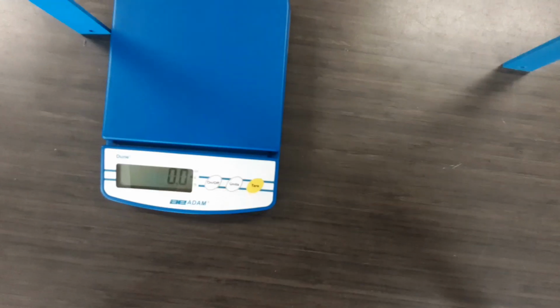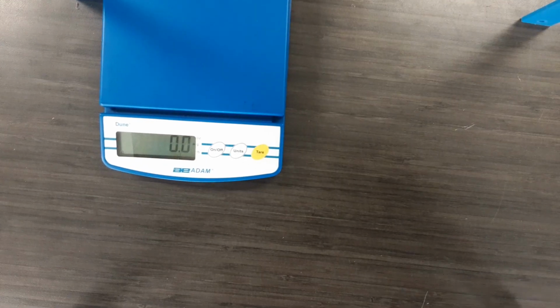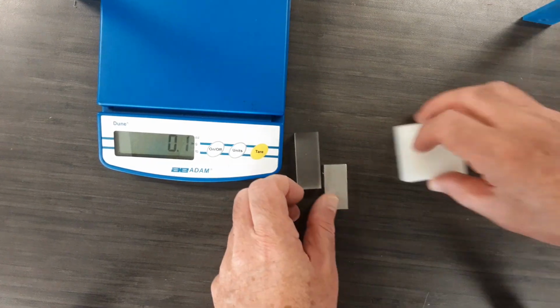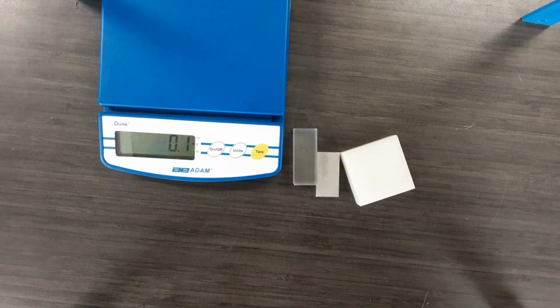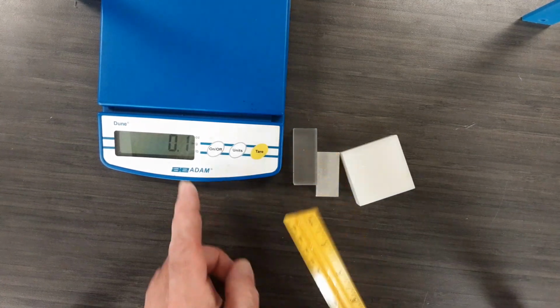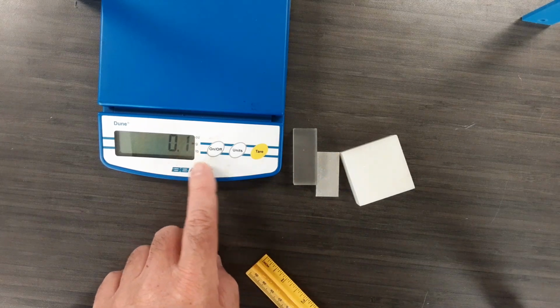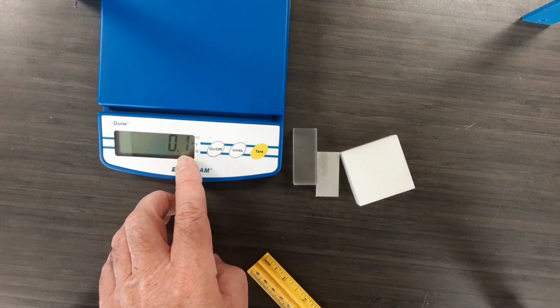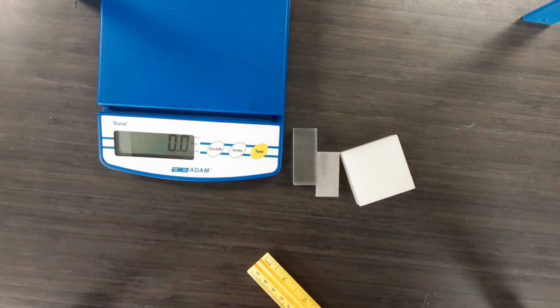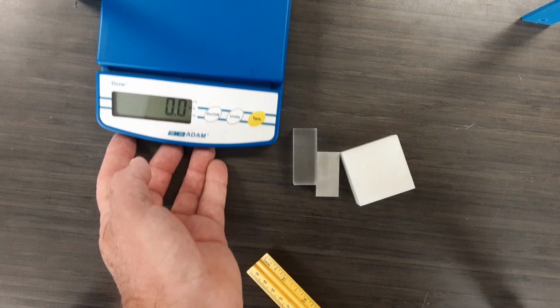All right, let's take a look at what's going to happen in the next lab. So the next lab, we still need our balance, but you're going to use a different method to find the volume of rectangular solids. And what you're going to do is take your ruler, and just a moment, look at how our balance has drifted a little bit. If it drifts, you hit the tare and it'll reset. All right, so I'm going to scoot this up a little bit.